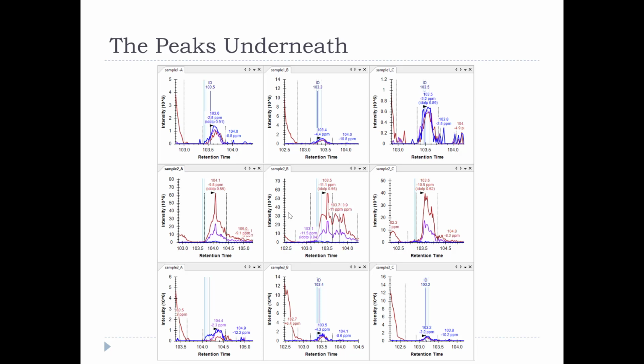That's like -10 ppm, and it's actually shifted a little bit to the right. But who thinks that there's some other tool that could actually extract the right peak area for this? Because that's where it's supposed to be. Maybe this little blip is it, or maybe that little blip is it.